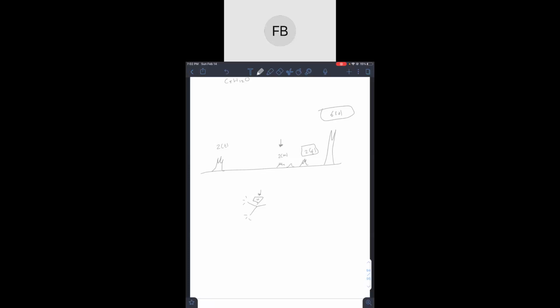So what would a 2 quartet look like? So it's 2 hydrogens that are next to 3 hydrogens. Perfect. If I drew it like this and there were 2 hydrogens here, these 2 hydrogens would need 3 hydrogens over here.